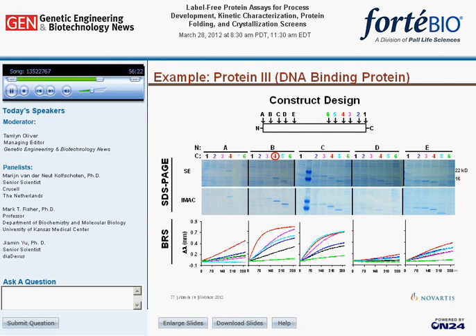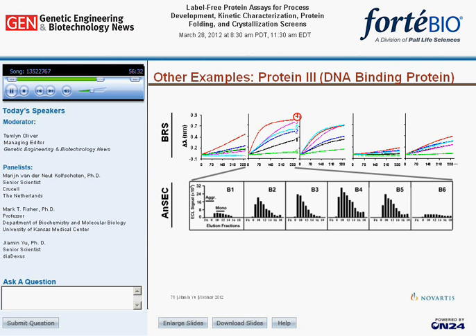Analysis of crude soluble lysate from the B series constructs by sizing and ECL immunoassay revealed that with protein 3, soluble aggregate was not an issue with any of the constructs. B4 simply contained the most monomer protein. So again, had we had the binding rate screen during the study of protein 3, we could have reached that decision to prioritize construct B4 within 20 minutes instead of trying to follow up with all the other constructs that look good by gel. Again, this method could have saved us a lot of research time and resources. Next slide.